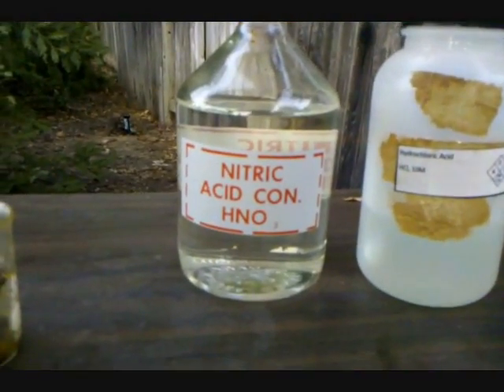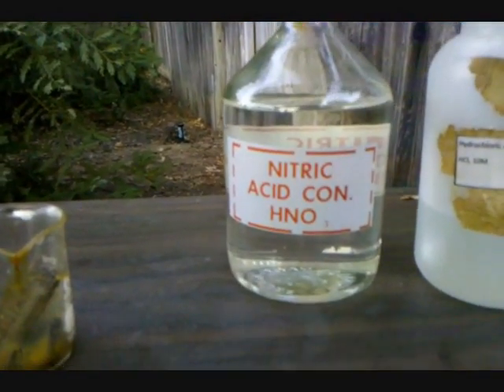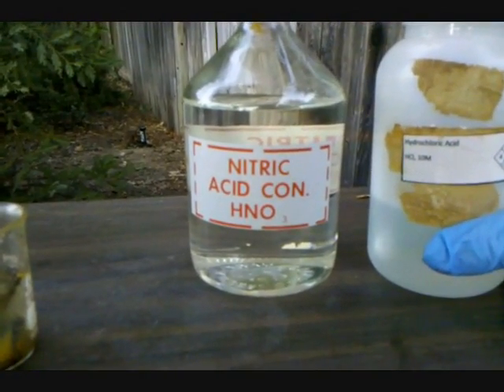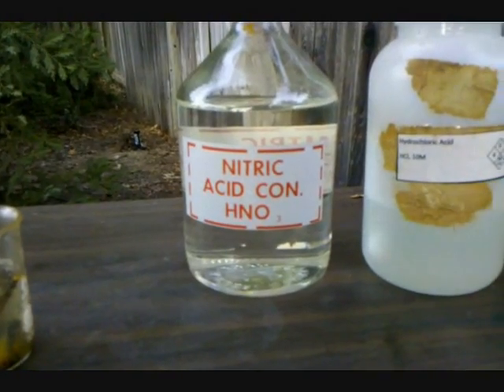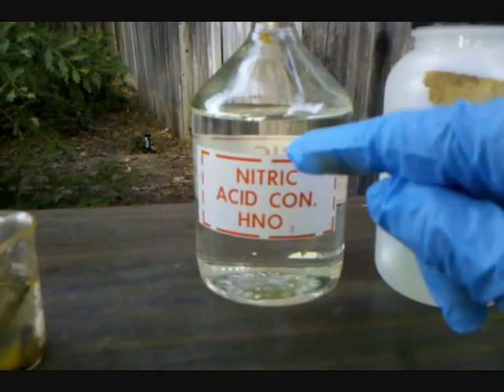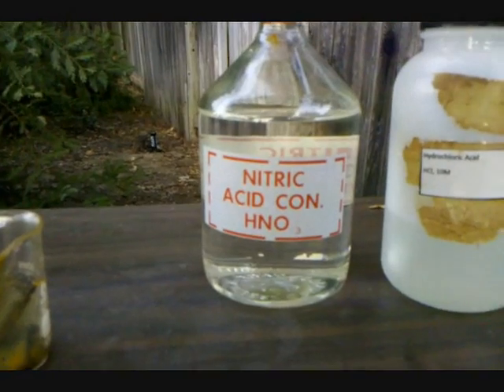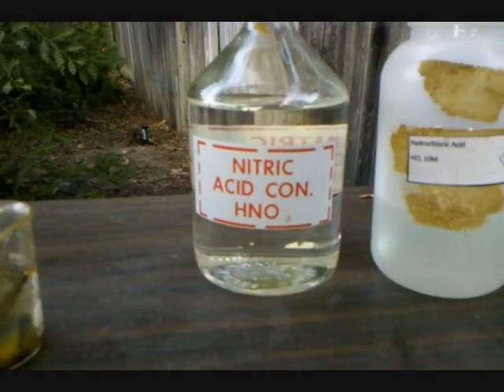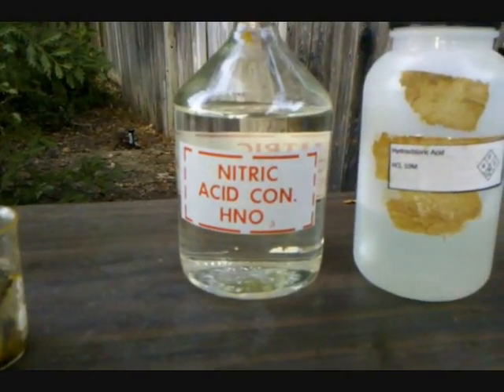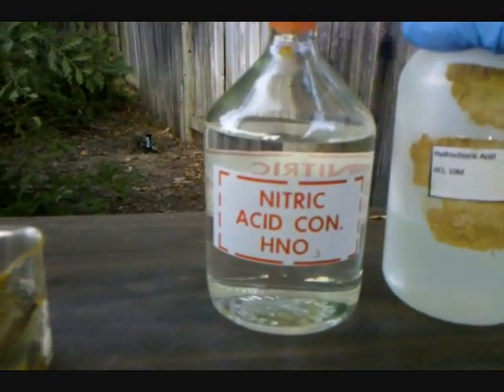The reason aqua regia dissolves gold is because nitric acid does dissolve gold, but only at a small equilibrium. When hydrochloric acid is added, the chloride ions attack the auric ions — the gold 3+ ions — when the nitric acid pulls them off to form the chloro-auric ion. Because that can't go back to form gold, it drives equilibrium forward and dissolves the gold. Aqua regia is a 3-to-1 mixture: one part nitric acid to three parts hydrochloric acid.